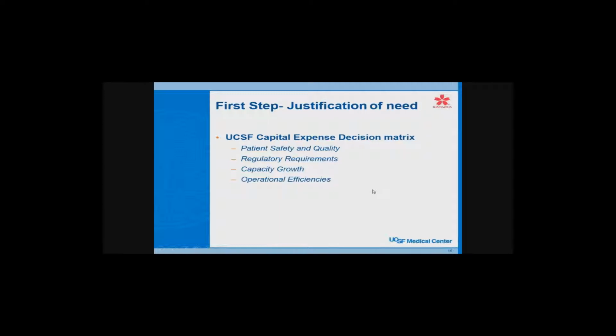You scan that container and you automatically print out a barcoded block or cassette. You fill that up. Those cassettes go off through tissue processing. When it gets to the microtome, it's scanned and produces a barcoded slide. So we have positive ID all the way through the system. That's kind of a recap of why barcoding is a nice thing to do. Good for patient safety, good for workload tracking, that sort of thing.